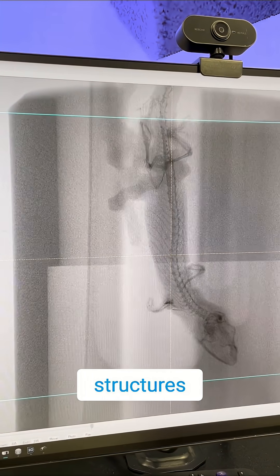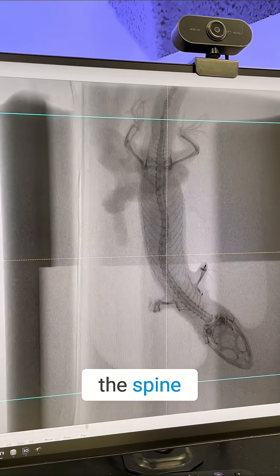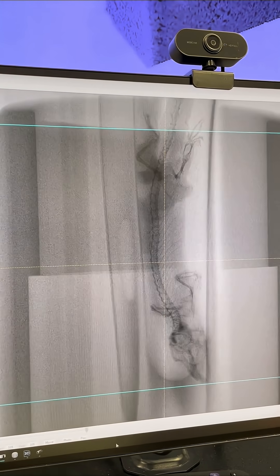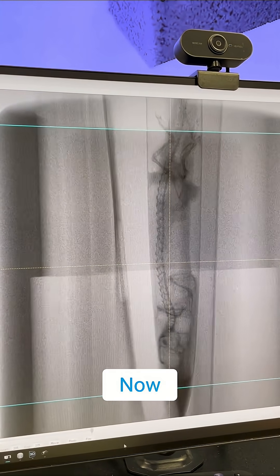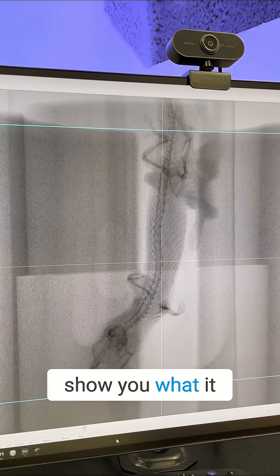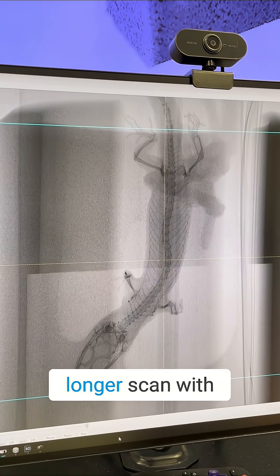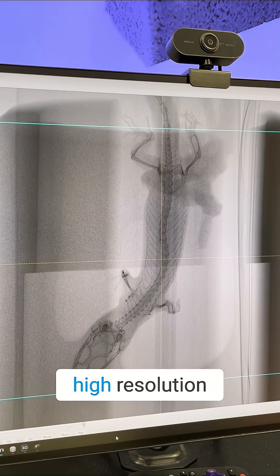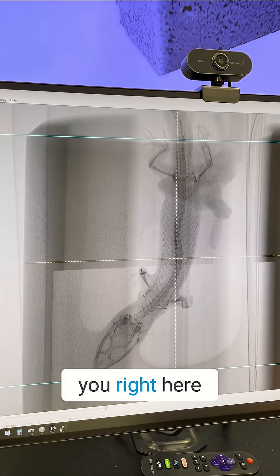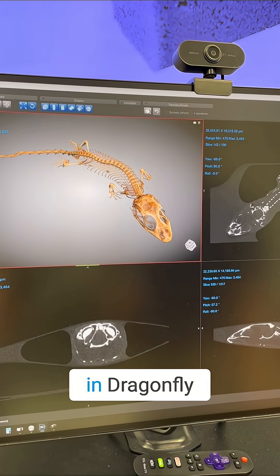You can see all the bone structures from the head and the spine. We're ready to scan. We'll run a scan, but I want to show you what it looks like after we do a longer scan with a high resolution, because we already performed that. Let me show you right here where I already loaded it in Dragonfly.